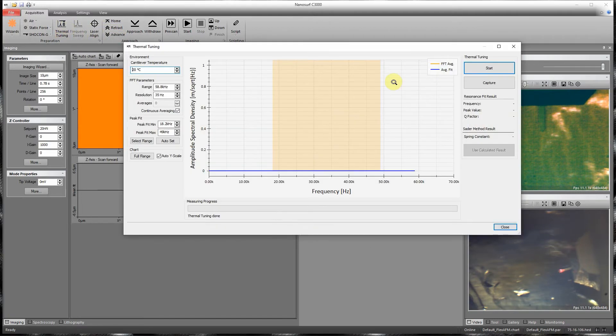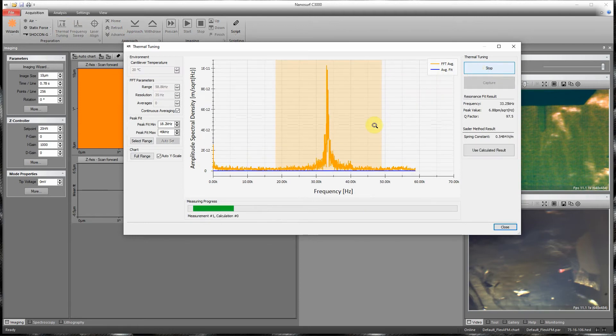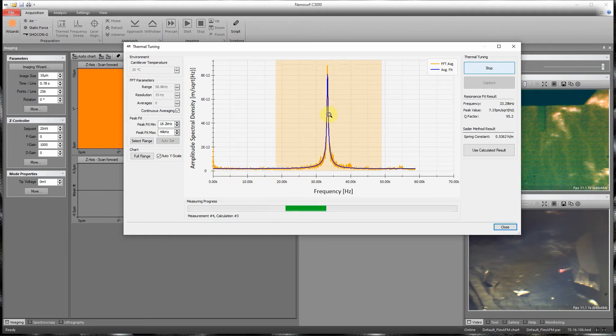Press the thermal tuning button and press start. What you see is the thermal fluctuations of the cantilever. The blue line indicates a fit to those thermal fluctuations.